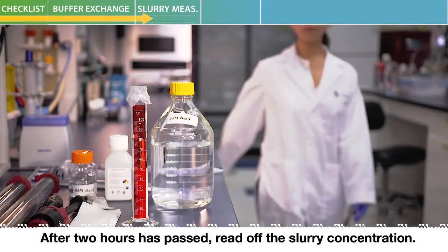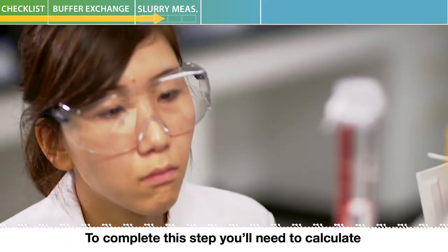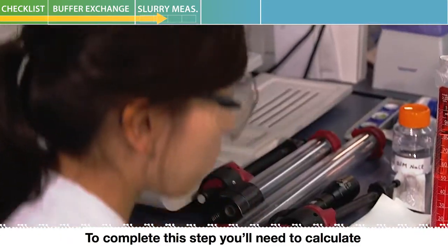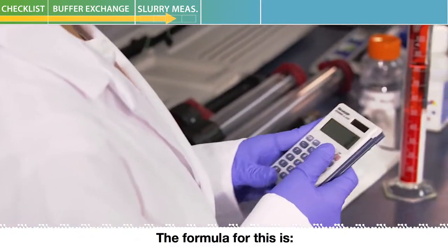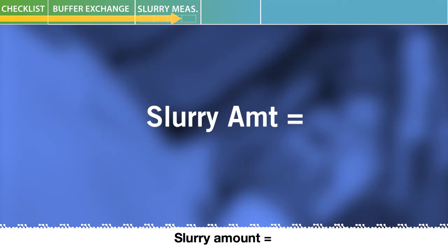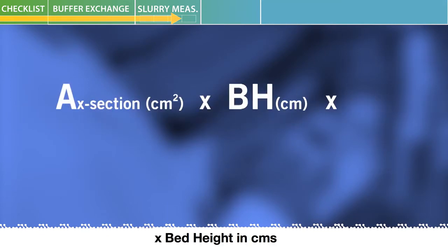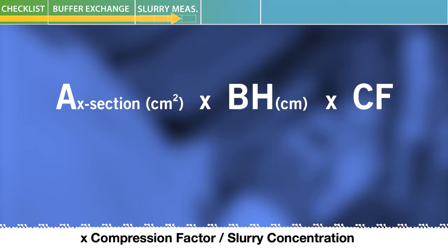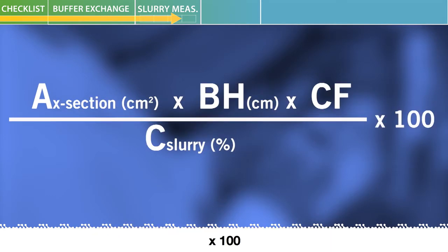After two hours has passed, read off the slurry concentration. To complete this step, you'll need to calculate the required slurry amount needed for packing. The formula is: slurry amount equals cross-sectional area in centimeters squared times bed height in centimeters times compression factor, divided by slurry concentration times 100. The recommended compression factor is approximately 1.15 for HiScale 1640.